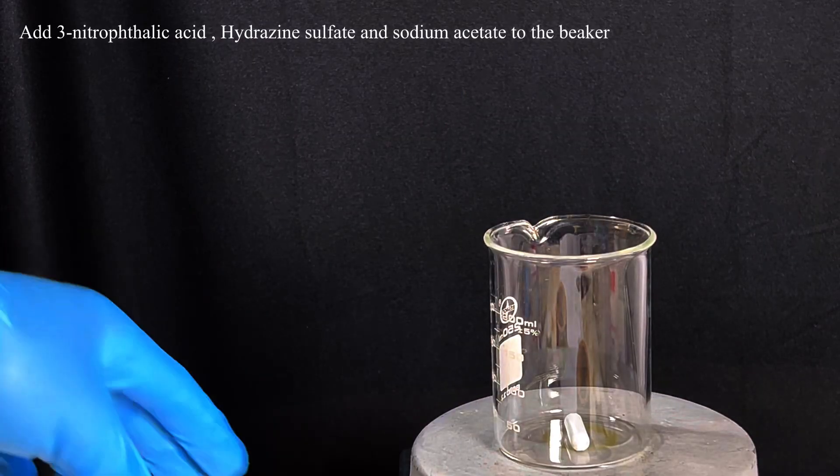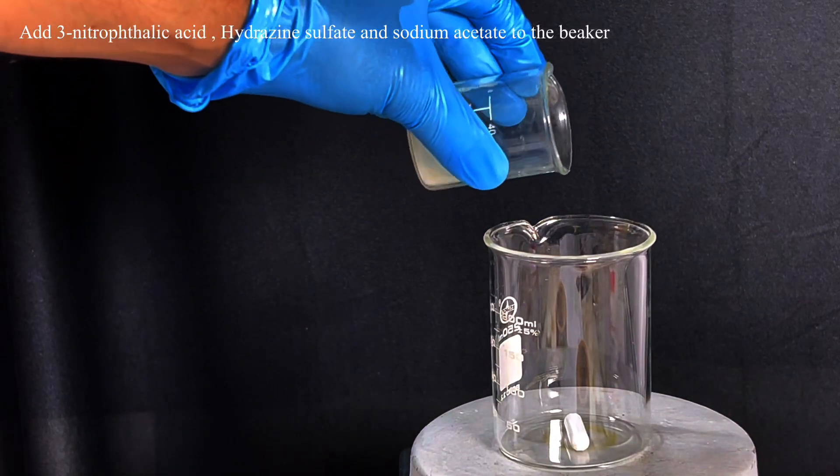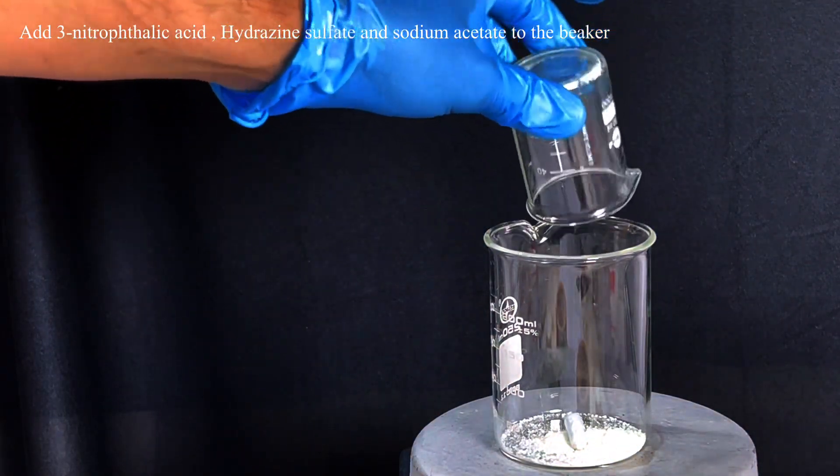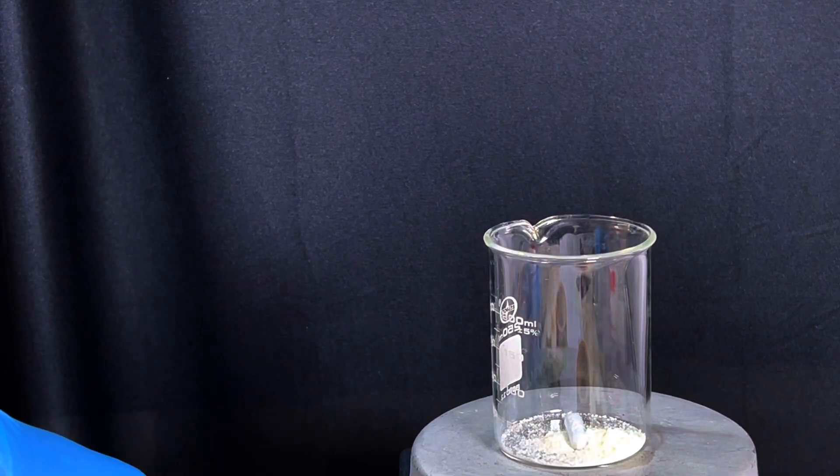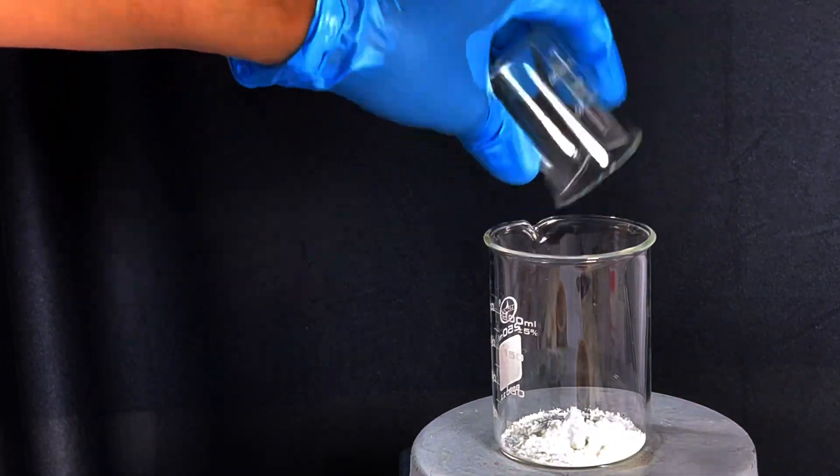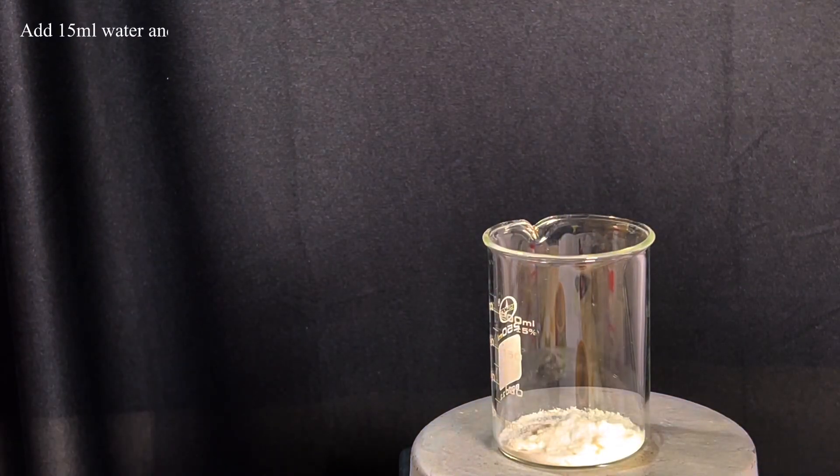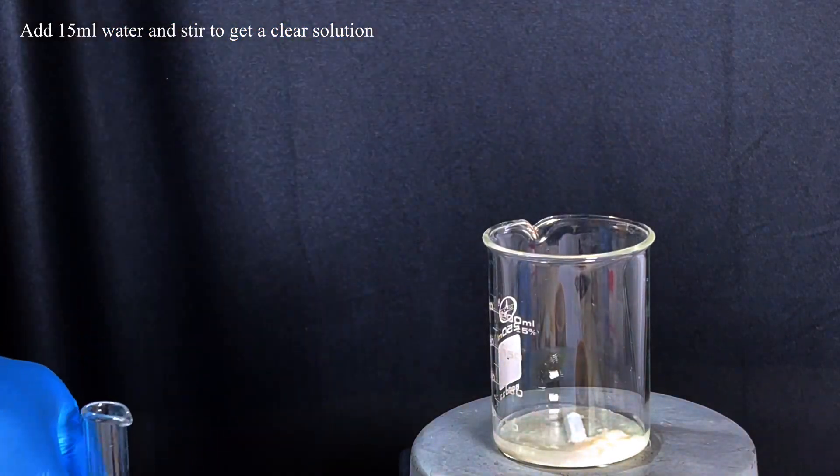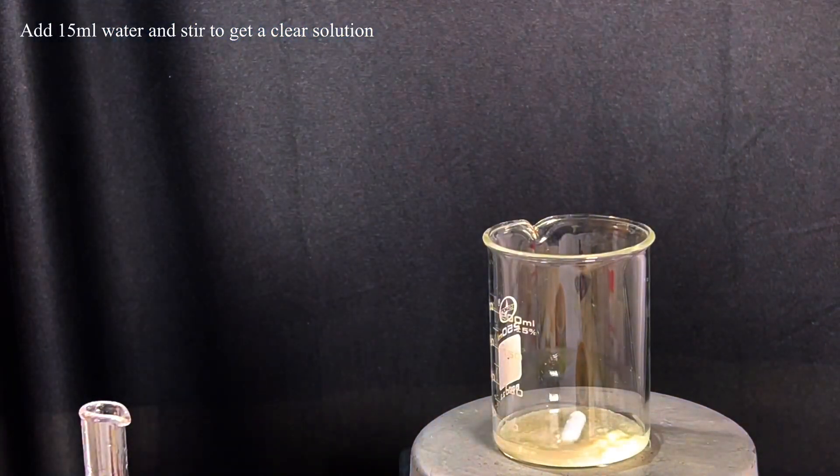Start by taking a 250 milliliter beaker and then add 2.1 grams of 3-nitrophthalic acid, 1.5 grams of hydrazine sulfate, and 2.1 grams of anhydrous sodium acetate. Add around 15 milliliters of water and stir to get a clear solution. You might need to heat up a little to dissolve everything.